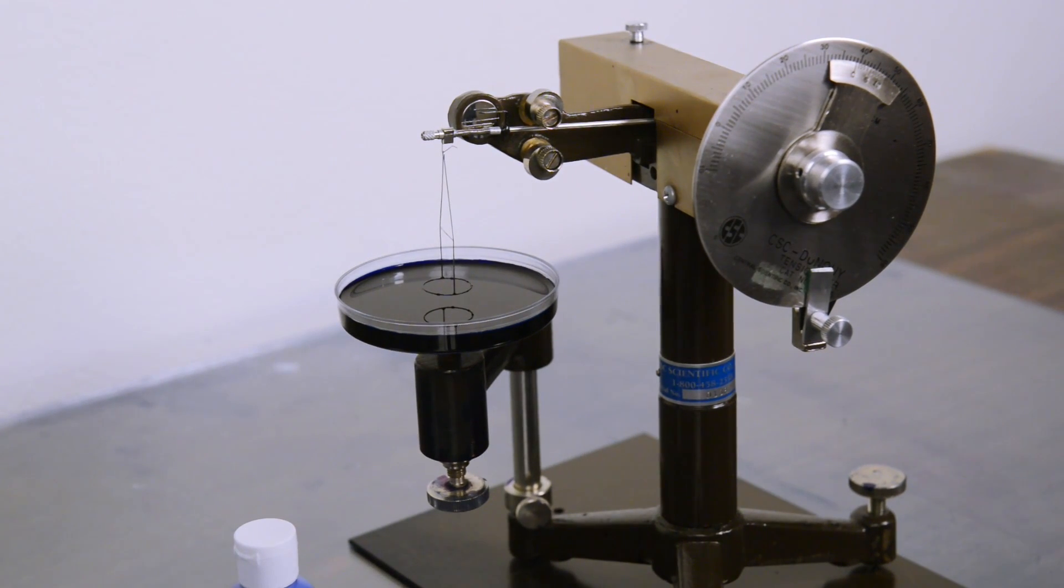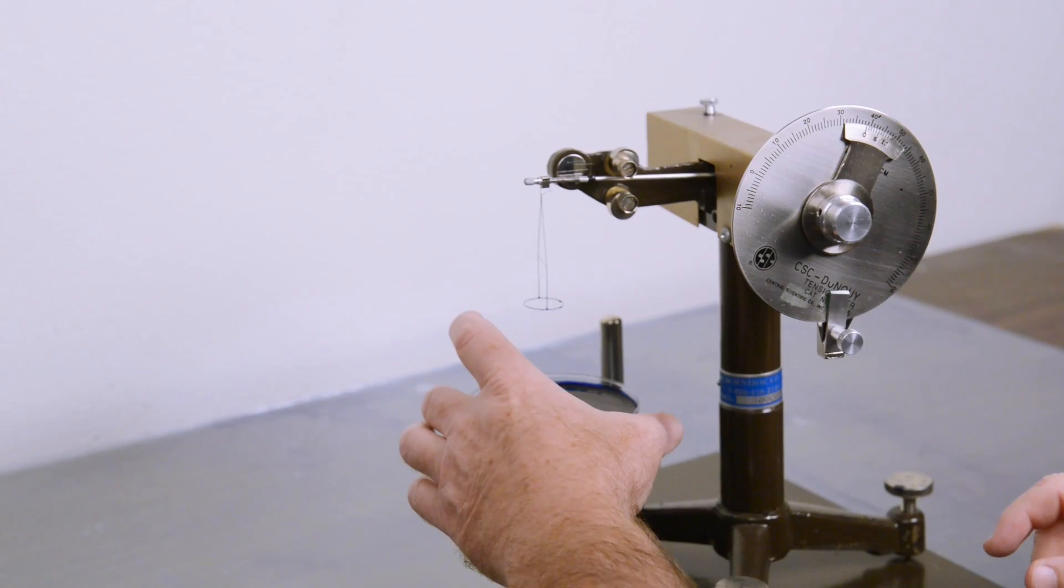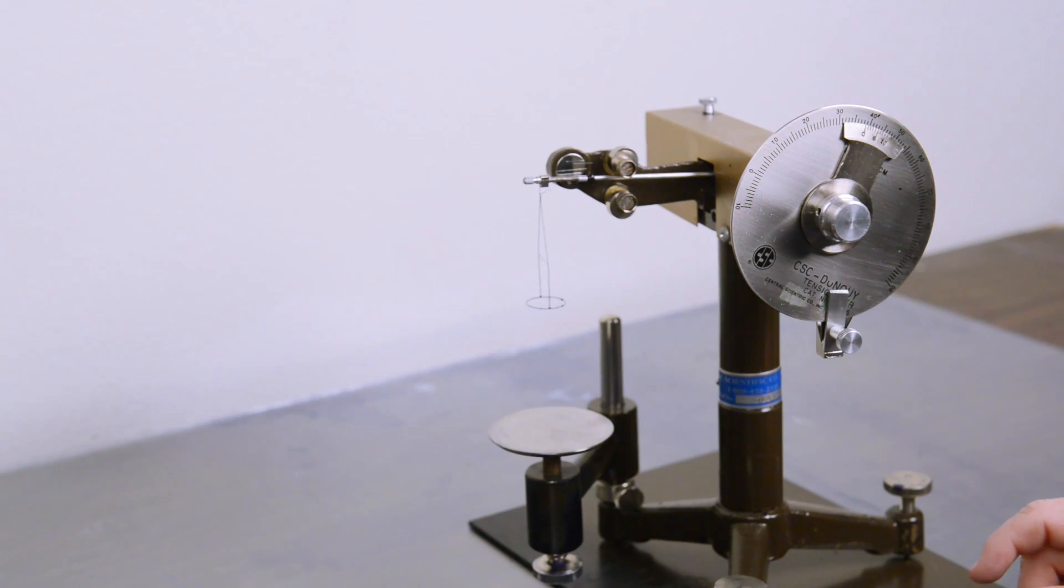Now we are going to take a sample of our competitors and see how theirs compares against the accuracy of ours.